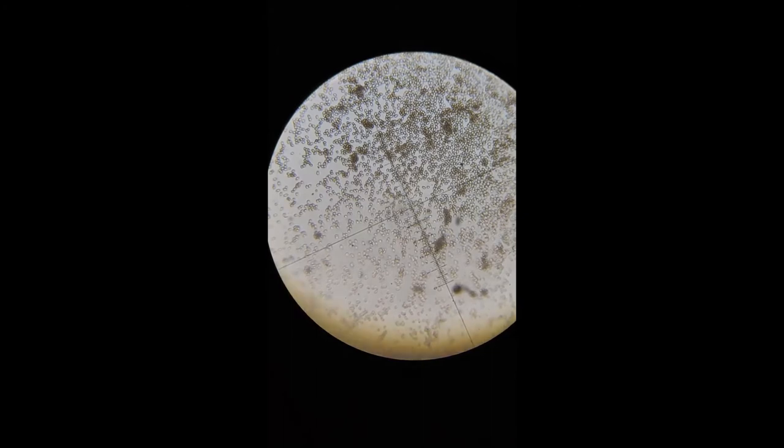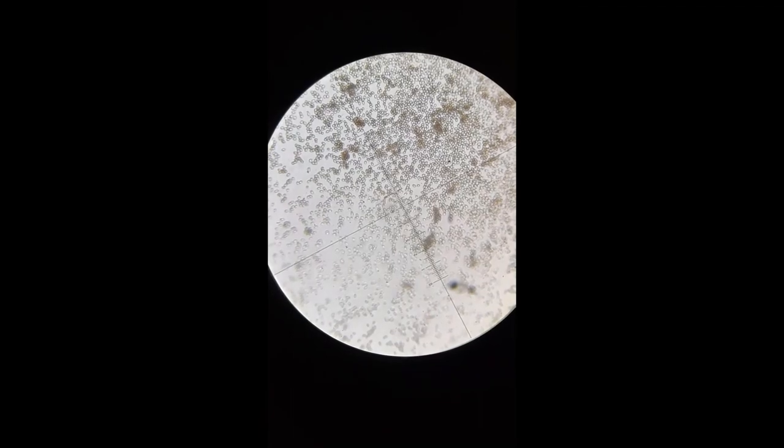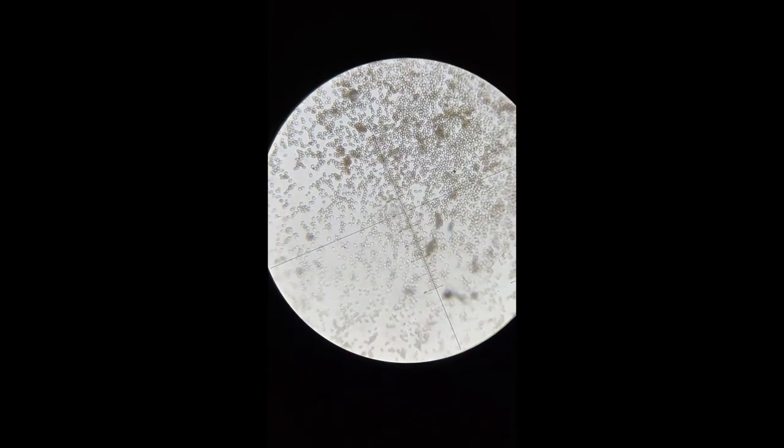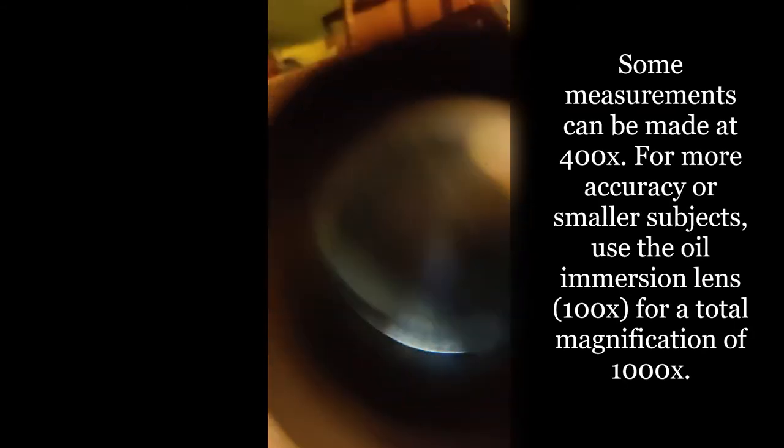So as you can see, they're quite small, and because we're looking at them under 400x that's not a one to one ratio with the little ruler. So I have a cheat sheet here I'm going to show you.